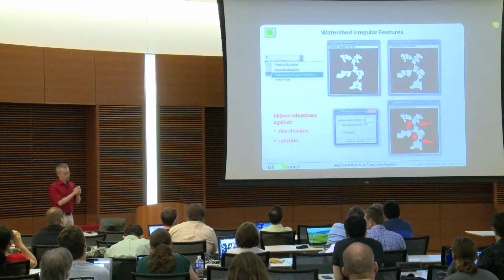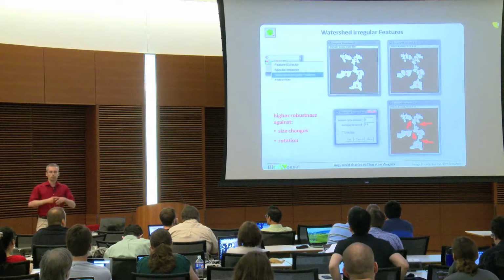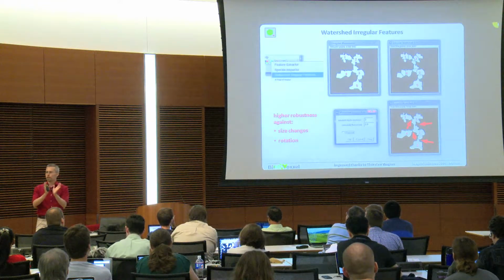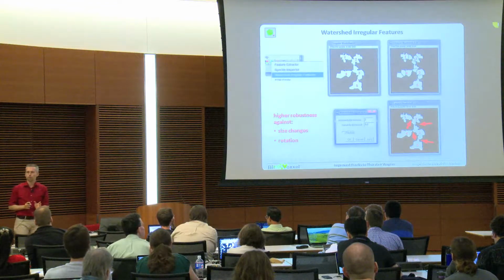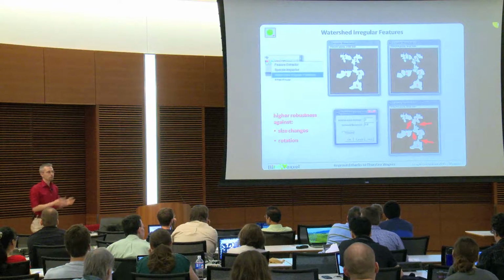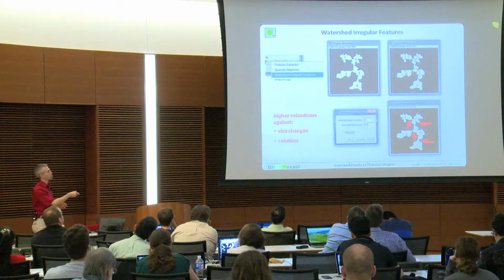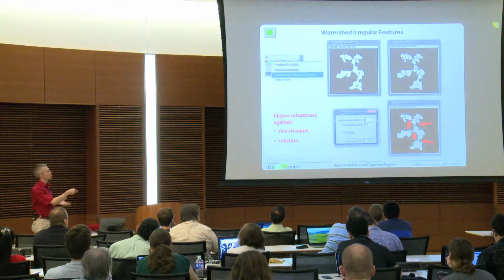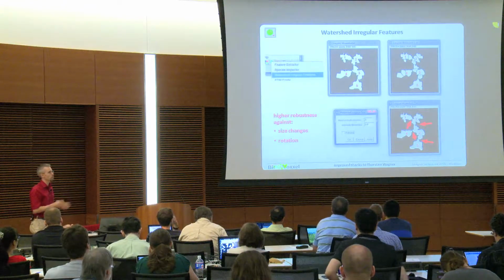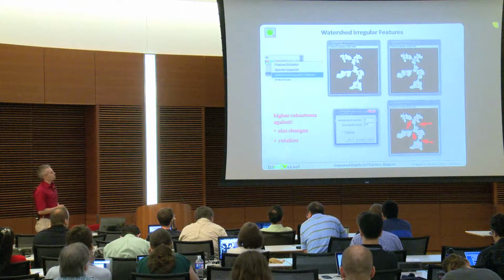Before we do that, additionally, the explanation for the watershed. The watershed is a very nice function as soon as you have elliptical or oval things which are connected by a thin connection, then it works perfectly. But what if you have these kind of amorphous objects? Then it is troublesome, because if I apply the normal watershed, then I get this one. I have actually 5 objects, and after my watershed I have several more, so I over-fragment those particles. This is what I obviously want to avoid.